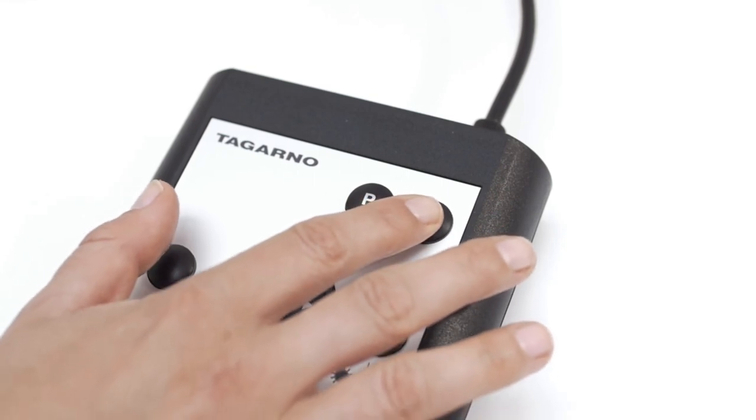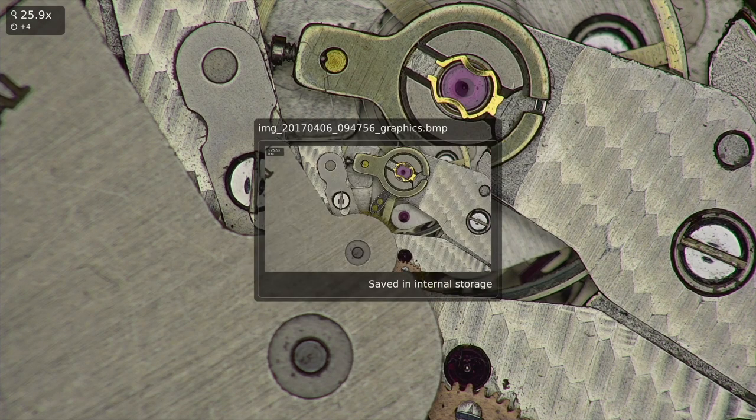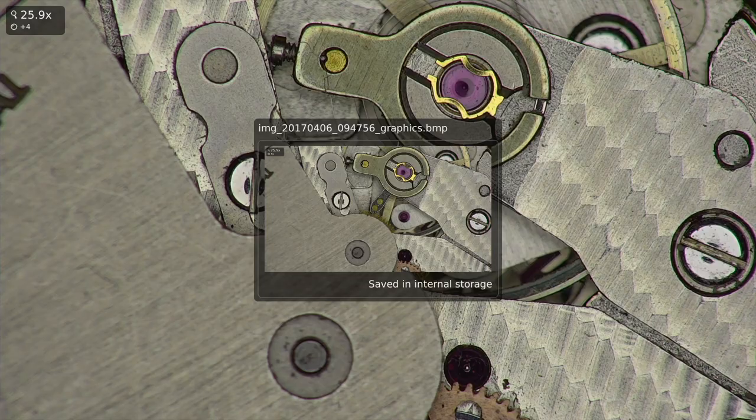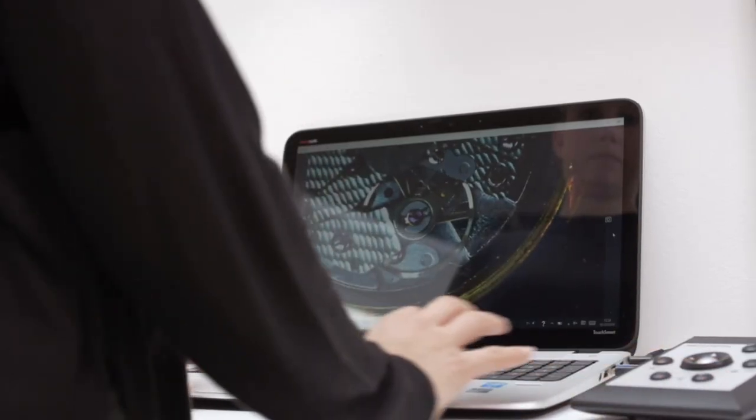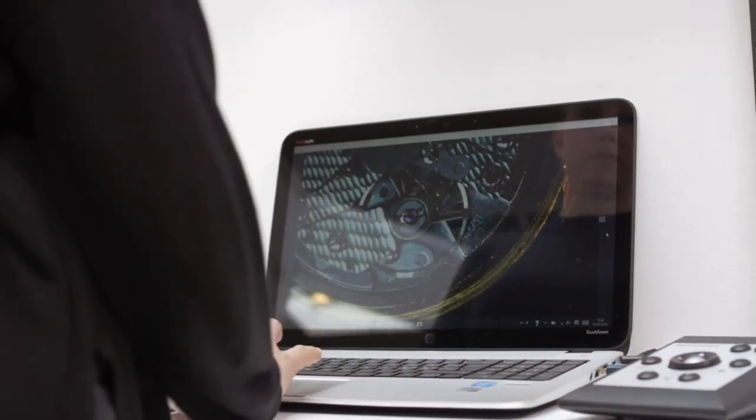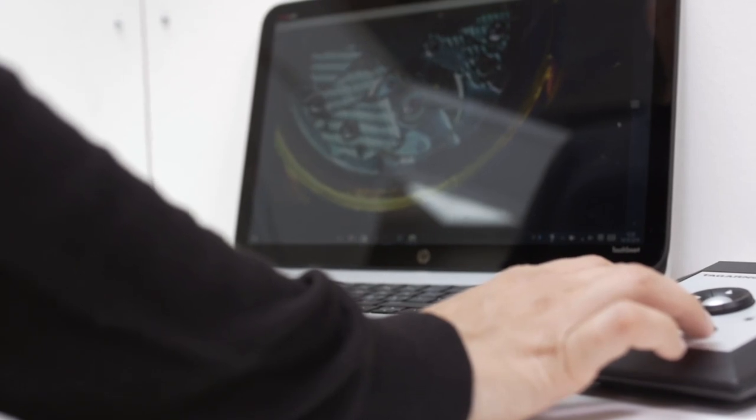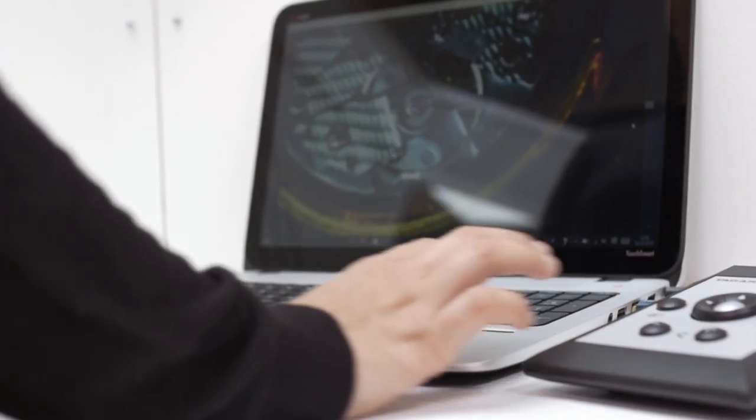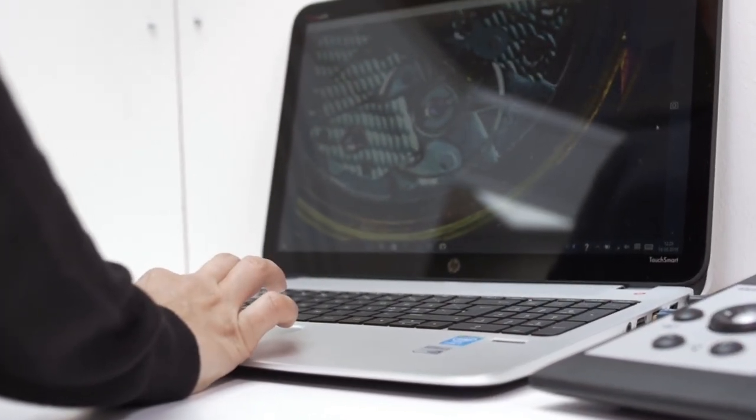By being able to quickly capture uncompressed images and video in full HD quality directly to the microscope or to a computer, I can easily share high-quality documentation with my colleagues and business partners.